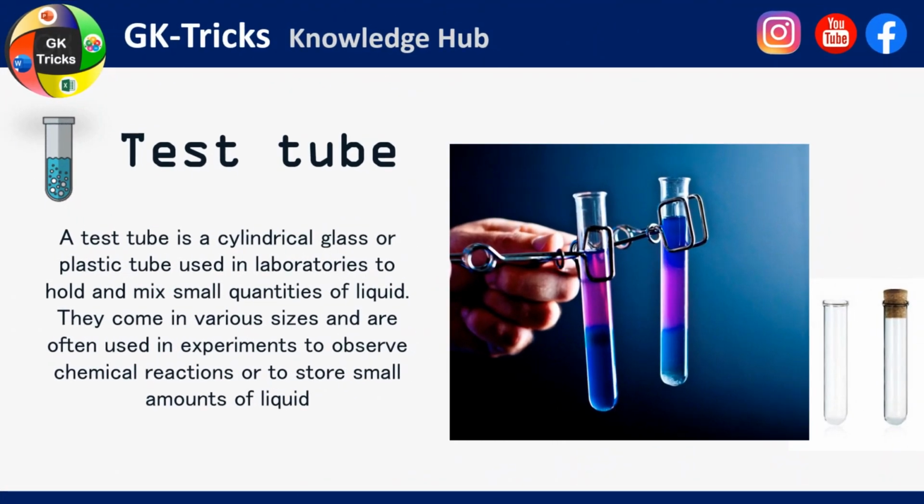Test tube. A test tube is a cylindrical glass or plastic tube used in laboratories to hold and mix small quantities of liquid. They come in various sizes and are often used in experiments to observe chemical reactions or to store small amounts of liquid.